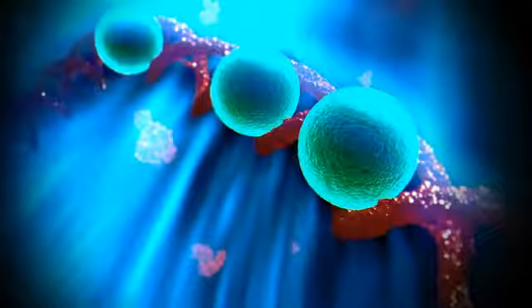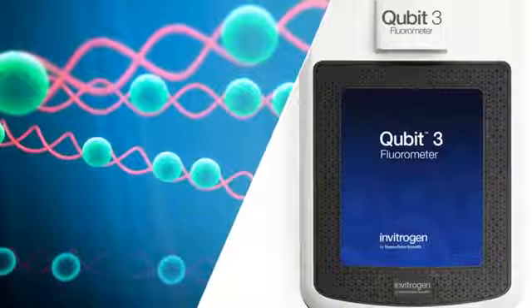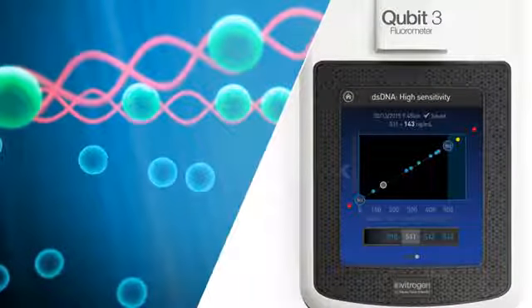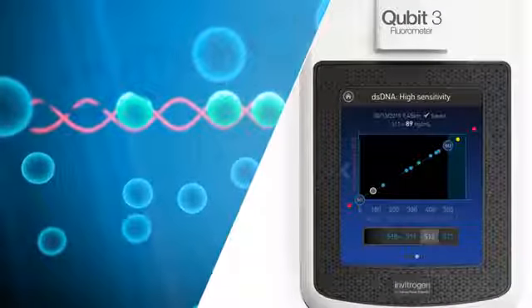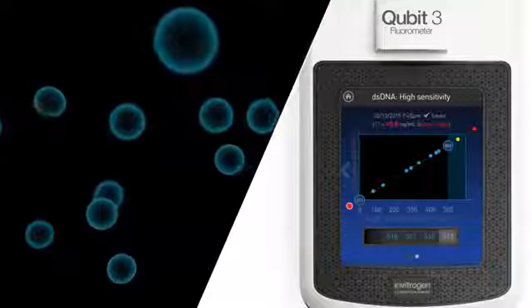In this example, we show a double-stranded DNA assay. The fluorescence intensity directly corresponds to the concentration of the biomolecule present in the sample. Fluorescence assays can accurately detect very small quantities of the analyte. A fluorescence-based assay does not detect degraded material.